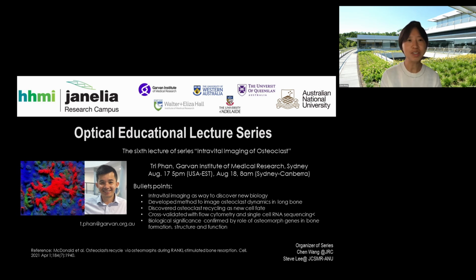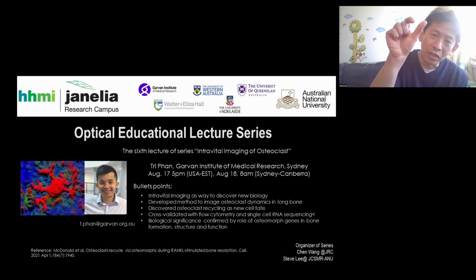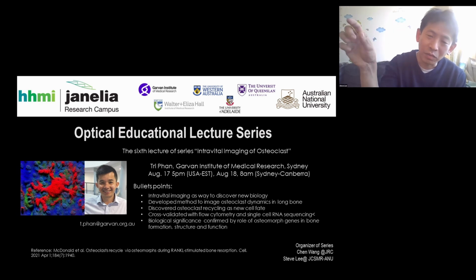Cost aberration. So Steve, what type of adaptive optics method did you use? We've done adaptive optics rastering. So instead of looking at the full field, we partition the segments to correct, and instead of correcting individual areas, we correct for every single line in a polygon scanning unit.